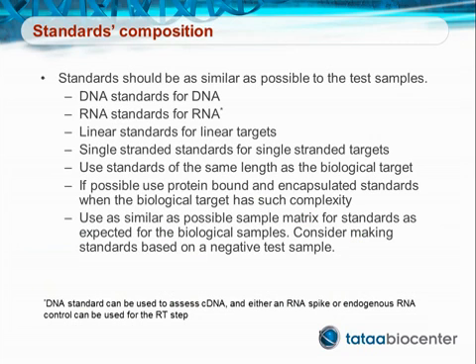When it comes to the composition of the standards, it can shortly be summarized in that the standards should be as similar as possible to the target we are analyzing. Preferably, we should use a DNA standard for a DNA target, an RNA standard for an RNA target, a linear standard for a linear target, single-stranded standards for single-stranded targets. We should use standards of the same length as the biological target.